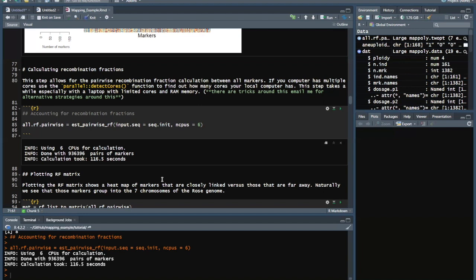I'm not quite sure I understand the question. If anybody else, if Chris or Gabriel understands the question better, or maybe I'm just not understanding it. Just to avoid genotyping errors or wrong SNPs which are called due to any genotyping or sequencing issue, take into account only those SNP locations which are present in the parents, and then any other locations will be filtered out.